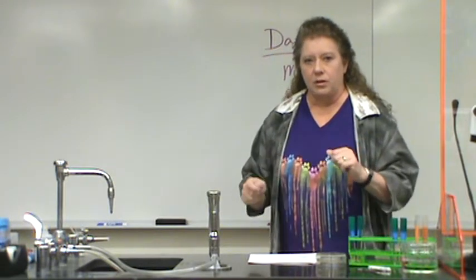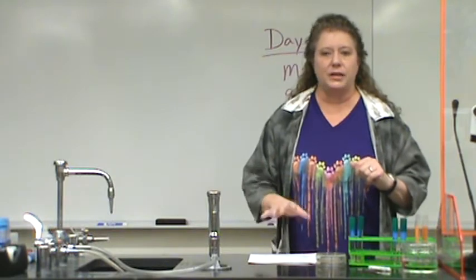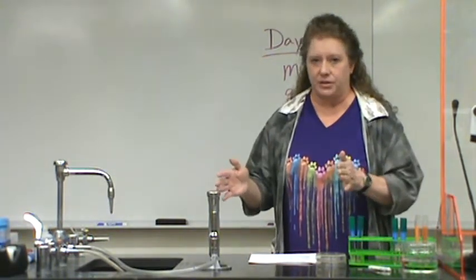Now on to the new inoculations and tests you're doing this week. These inoculations and tests are going to tell you what the species of bacteria is.